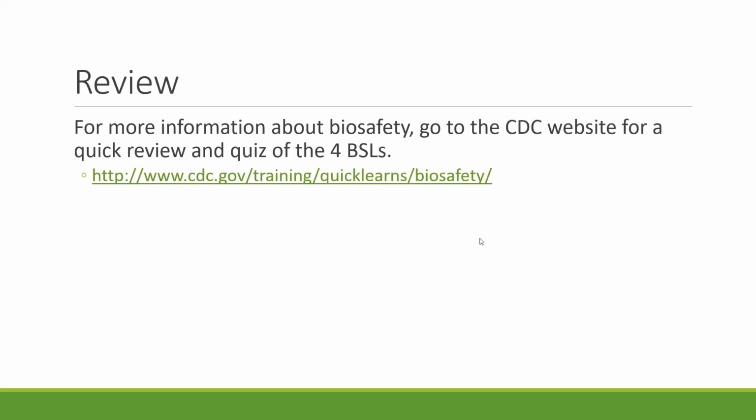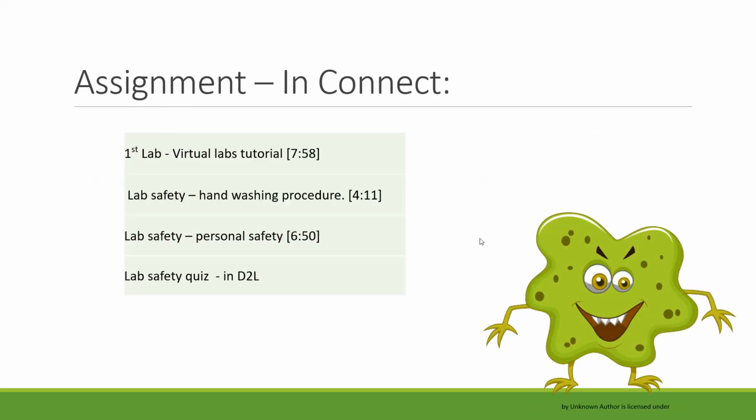There is a CDC site that can help you with understanding those biosafety levels. In order to learn more about biosafety, personal safety, and lab safety, there are some things you need to do in Connect. The first thing is you should have already done the virtual lab tutorial. That is going to be the very first thing, so if you haven't linked on it yet, it will help you get registered for the online lab section.